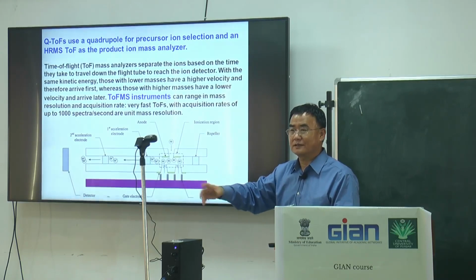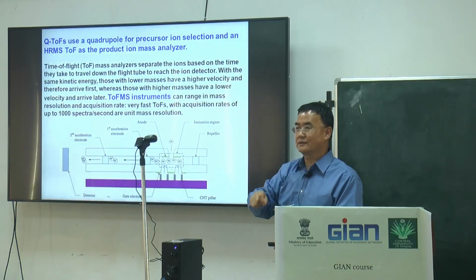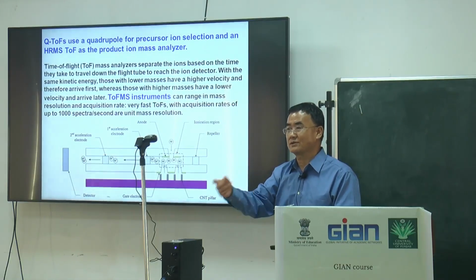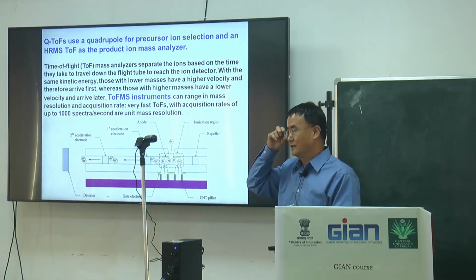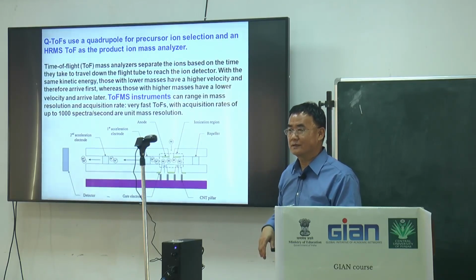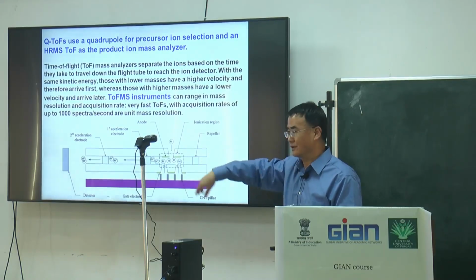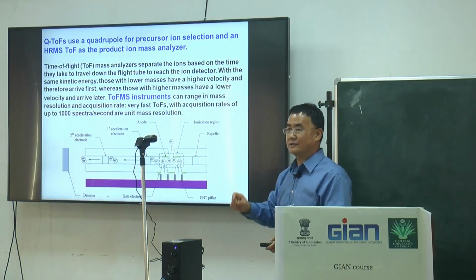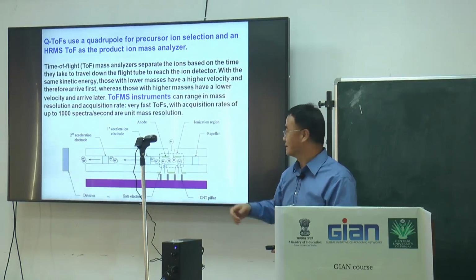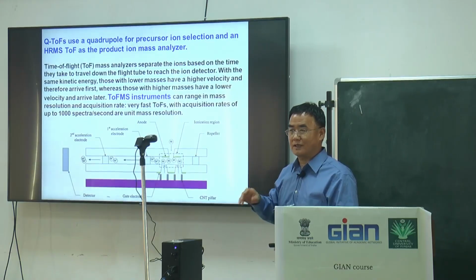Then sometimes we leave this overnight, from 8 o'clock in the evening. The next morning we take this at 4 degrees with rotation extraction, so you fully extract. The second morning we do the centrifugation, using a 12,000 rpm tabletop centrifuge, because we only extract 1 mL. We don't need to extract a lot. This is LC, a very small scale, very high sensitivity analyzer.